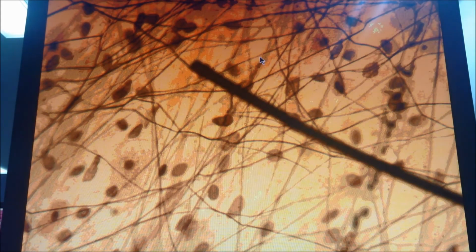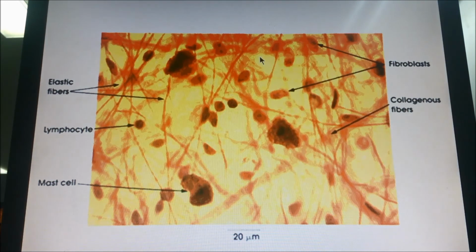The same thing, a spread section for the mesentery. You can see the elastic fibers clearly. You can see the cells, the fibroblasts. But the collagen bundles you cannot isolate them. بكونوا بالbackground, and this technique is not very clear. Also, a spread section. The thin fibers هم elastic fibers. هاي pointer عليهم هنا وهون. The elastic fibers. The thicker bundle in the background هم الcollagen.